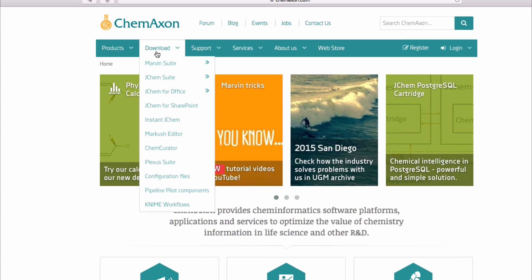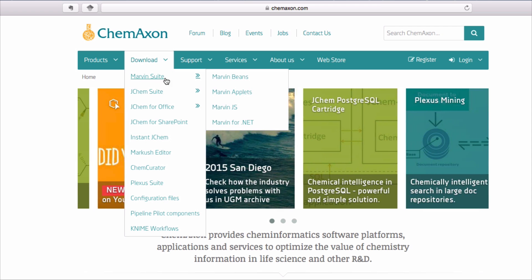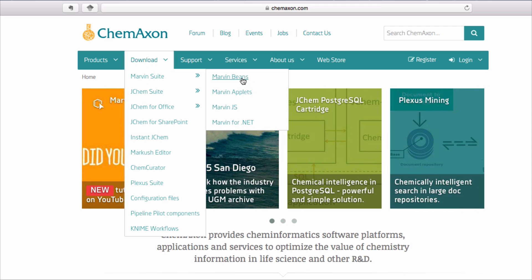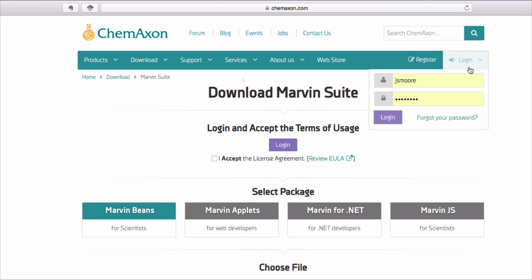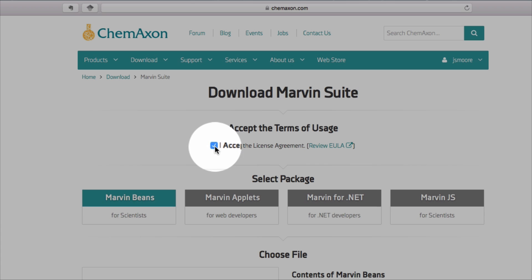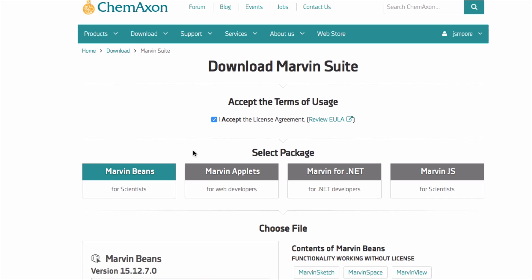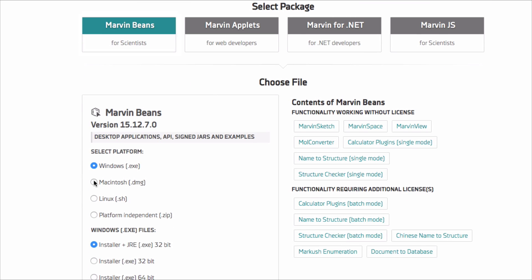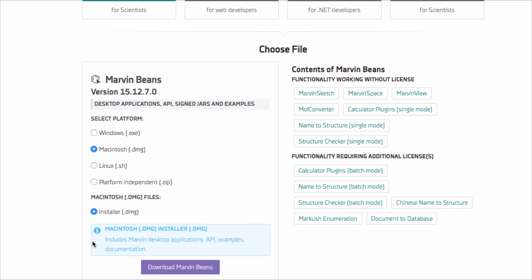After you register, choose the download menu, MarvinSuite, and MarvinBeans. Login with your username and password. Once you've logged in, review and accept the license agreement. Scroll down and select your platform.